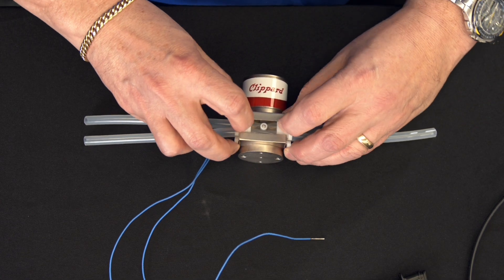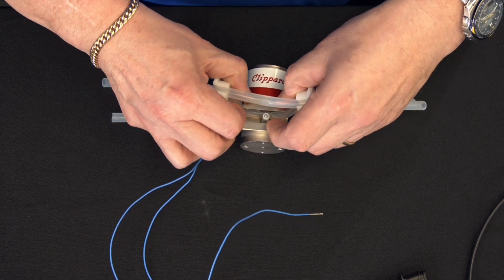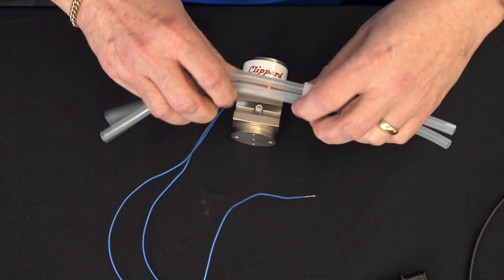First, we're going to take the tubing out of the existing valve. It's easy — just remove the tubing and pull it straight out. It's fairly easy and simple.